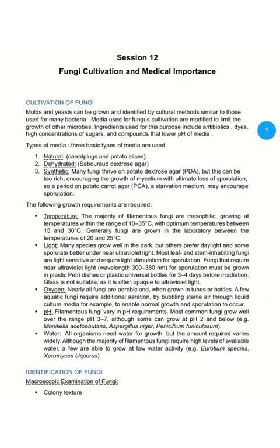certain ingredients that inhibit the growth of other microbes, because usually the media for the fungi is very rich in nutrients. And as you know, fungi are mostly saprophytic and parasitic, so they tend to utilize as much of the nutrients as possible. That's why they require culture media with very high nutritive value.